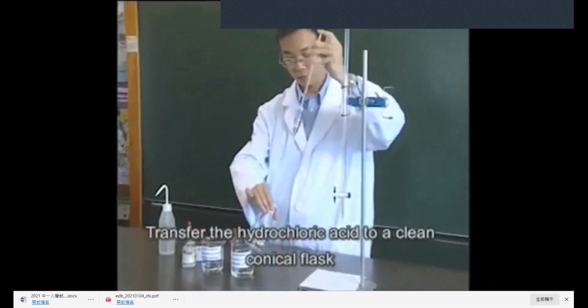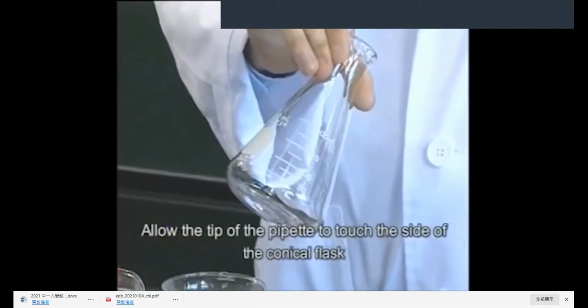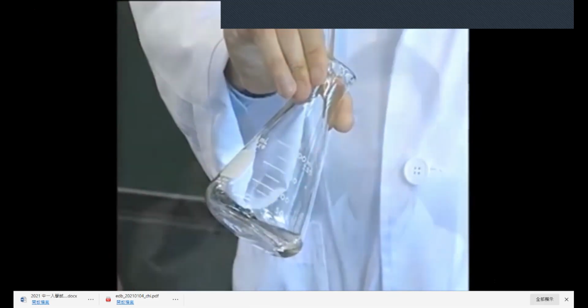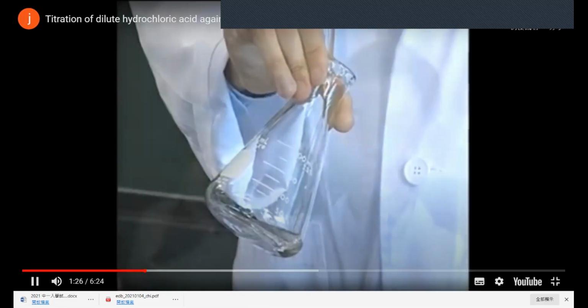Transfer the hydrochloric acid to a clean conical flask. Allow the tip of the pipette to touch the side of the conical flask. What did they say just now?